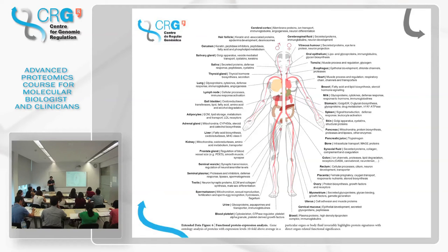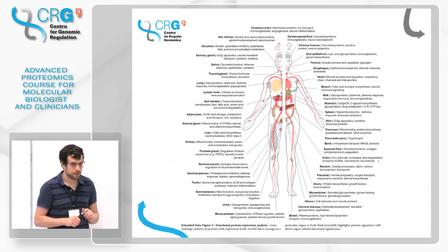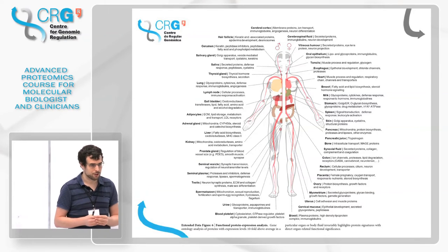Right? So any questions for these first papers? No? Any curiosity? How did they quantify? So they did an estimation of the abundance of proteins. For example, in this case, I think they show a method that is called iBAQ, right? And this is an estimation of protein quantity based on the abundance of each of the peptides present for that particular protein. Right? But we will also review all these concepts in the session on quantitation.